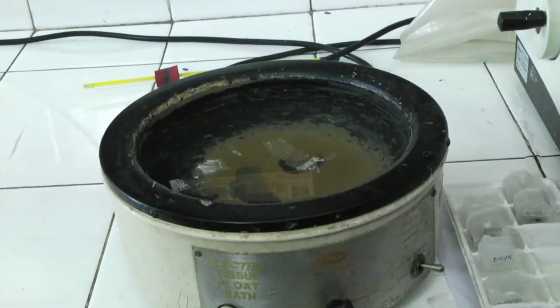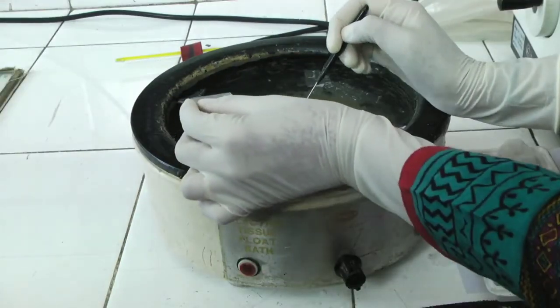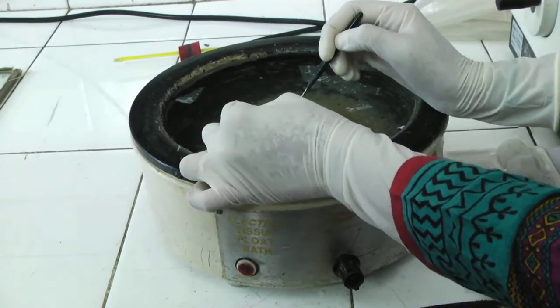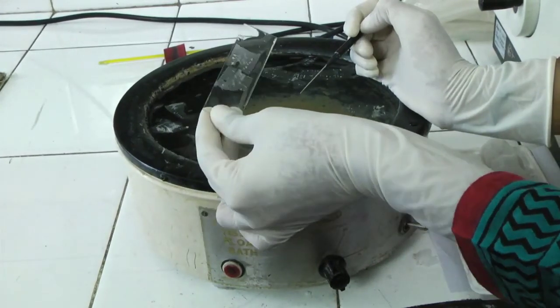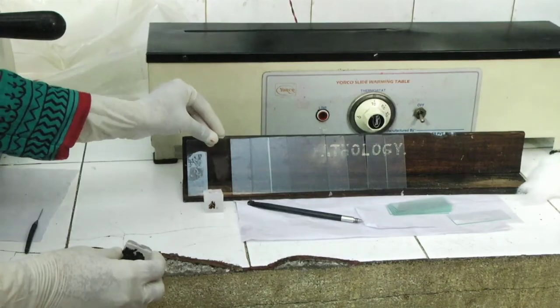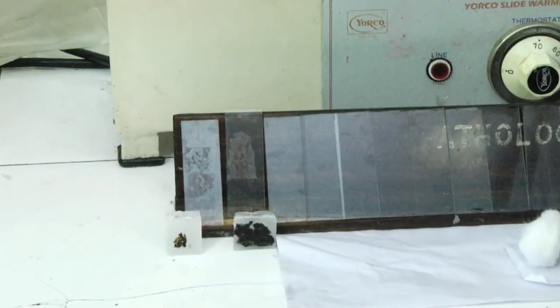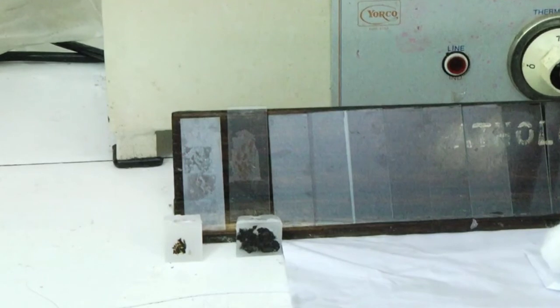The temperature of the water bath should be maintained at 50 to 55 degrees centigrade, which is around the melting point of the wax. The flattened tissue sections are placed on clean albuminized labeled slides and dried on the slide warmer. Slide warmer temperature is kept at 70 degrees centigrade and should be checked daily.